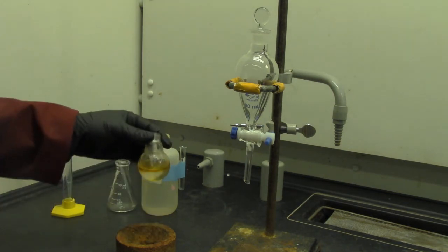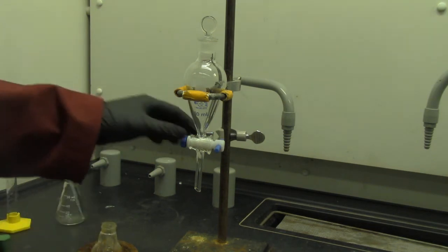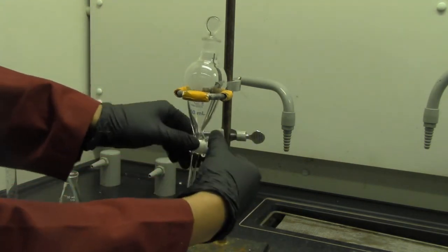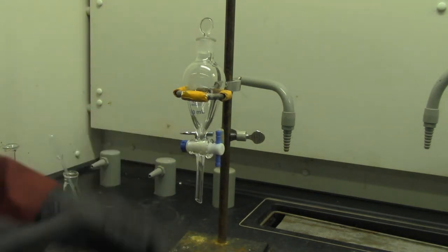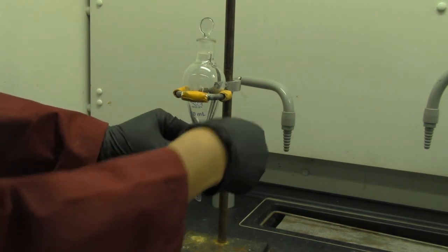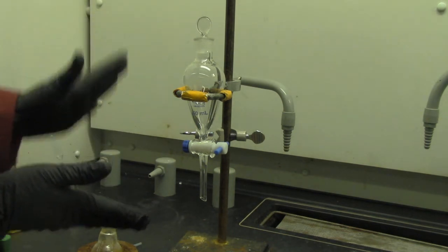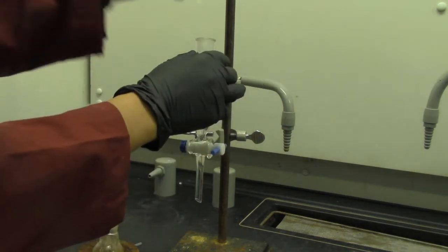It's good enough. So now I'm going to transfer this solution to a separatory funnel. Okay, we call this the sep funnel. So the bottom should be closed, right? So this is the open position. If you have it vertical, there's a little hole at the bottom, and if you put it at a 90-degree angle like that, that's closed. So you want to make sure the sep funnel is closed before you pour the solution mixture in. Okay, and open the top.